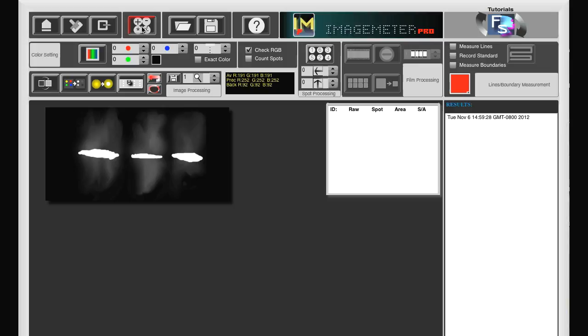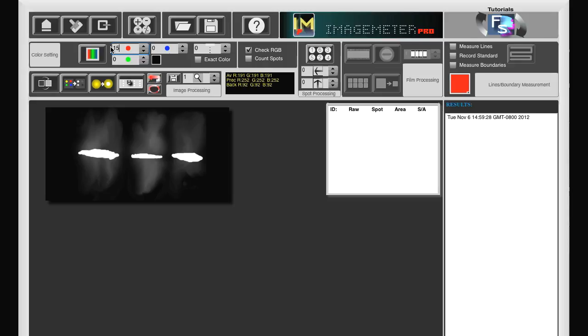We choose a preset RGB value, which is higher than the background value and lower than the highest value. For example, we can choose 150 for R, G and B.